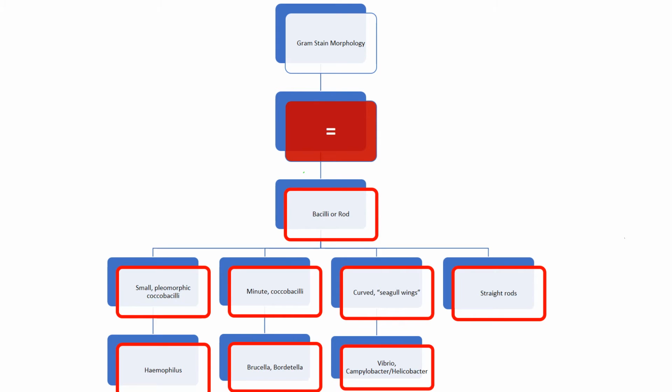So look at those descriptions, and because they are not isolated or encountered commonly in the clinical laboratory, so it is more for testing purposes and being aware that certain organisms, even gram-negative rods, will show you some very unique microscopic morphology or characteristics. Now, if the gram-negative rod is a plain boring straight rod, then that is when we have to do something a little bit more drastic or different. Okay?